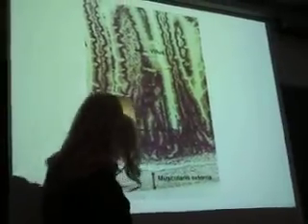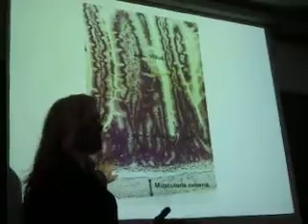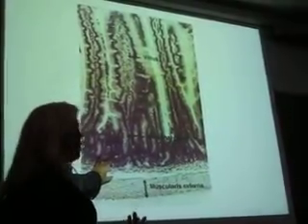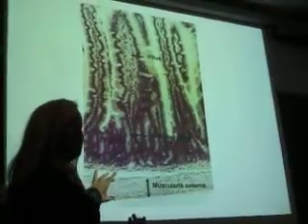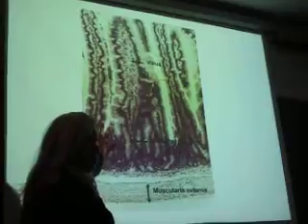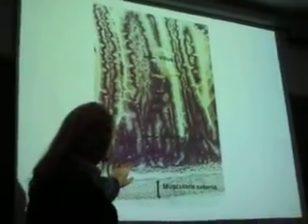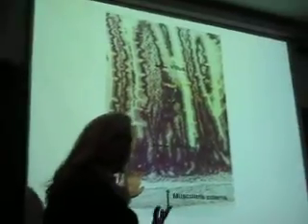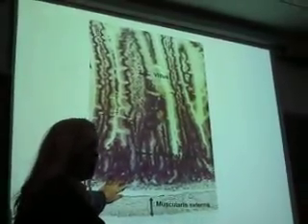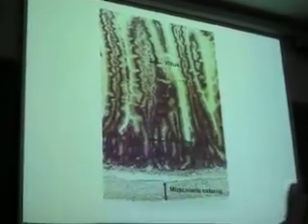This layer then is going to be submucosa. You know it has to be, even though you don't see that it's made of this loose connective tissue and fibrous connective tissue. But you know that it is because this is very obviously smooth muscle. And this up here is very obviously the mucosa. And what layer comes in between? The submucosa. Okay, so it's not about sometimes what for sure you see. It might be what you don't see. But sometimes you have to get to these answers by deductive reasoning.